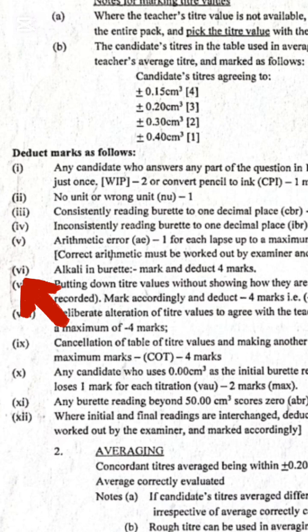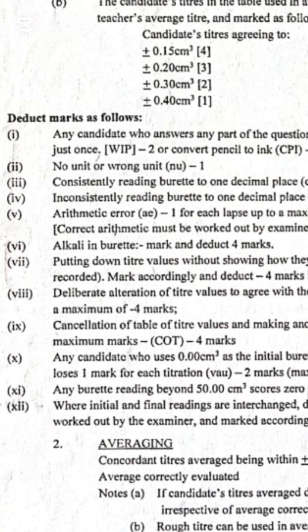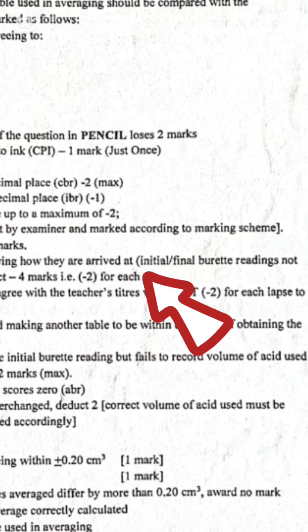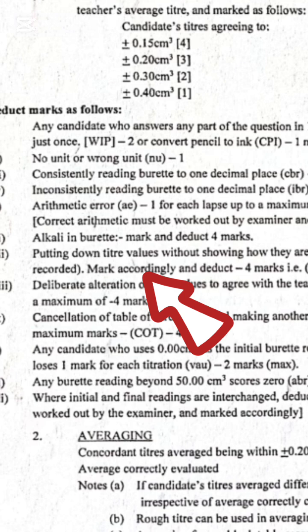Number six: unclear burette reading — that is minus four marks. Number seven: putting down titre values without showing how they are obtained — that is, when the candidate puts down titre values without showing the initial or final burette readings. We are told to mark accordingly, and it is minus four marks.